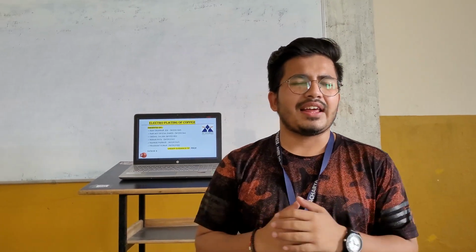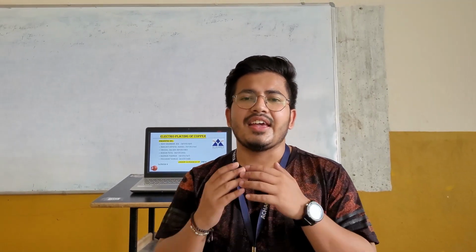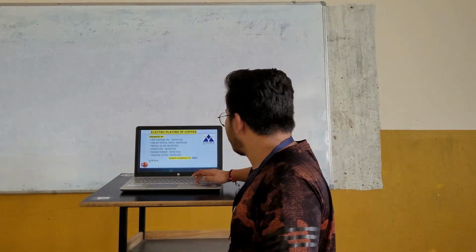Hello everyone, I am Ravi Shankar Jha, and today my group and I are gathered here to talk about electroplating of copper. As we see in our everyday life, there is so much corrosion here and there on metal surfaces, and this is actually harming our economy, our properties and everything. So today we are going to talk about a process which prevents corrosion, and that is electroplating of copper. It is a method. Now we will move further.